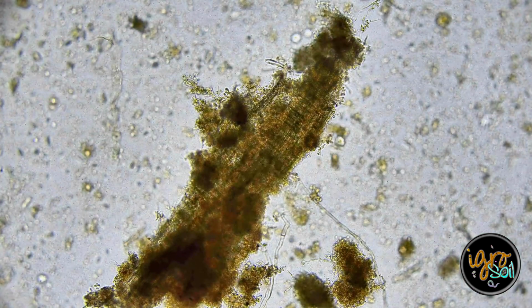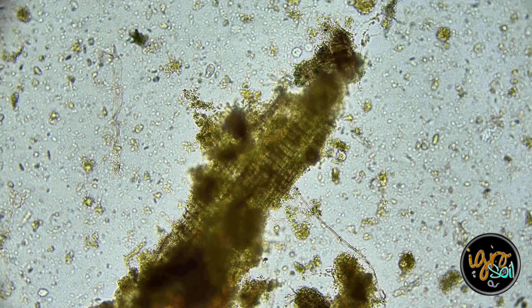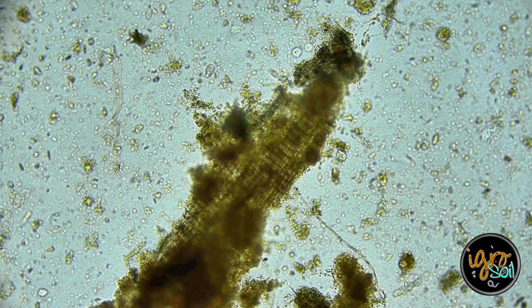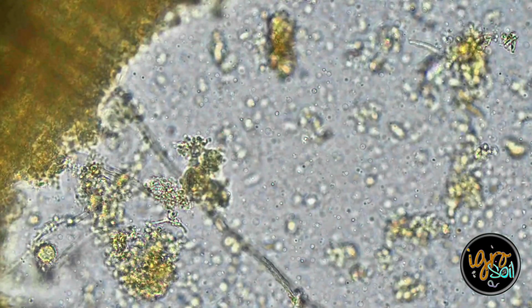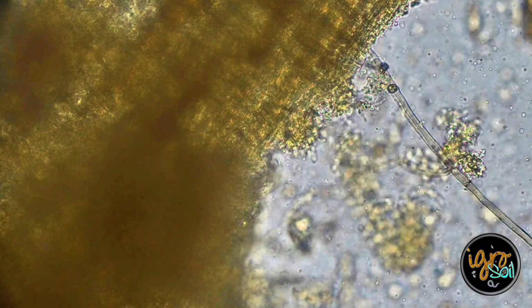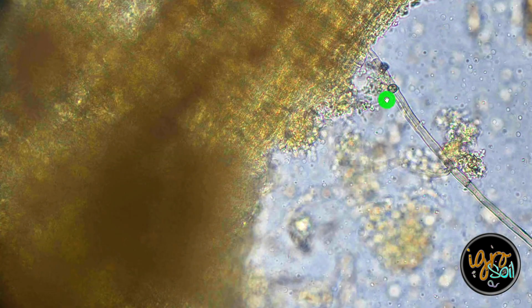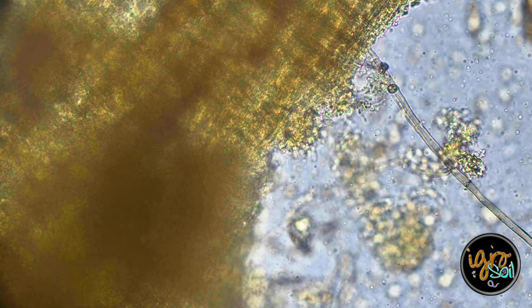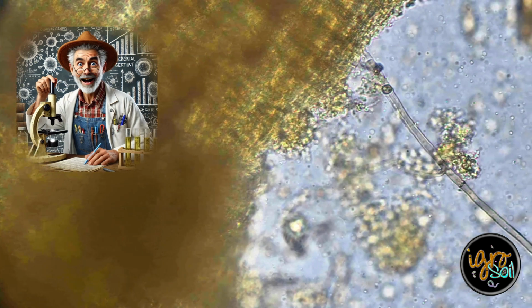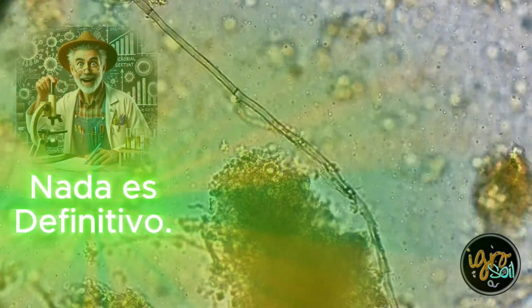Now here we're looking again at hyphae. I'm going to go back. Let's look at it. Look at the difference. You see how consistent that is? That's even got a spore. It's even producing a spore, probably. And everything's going to be probably and maybe here, okay? Because nothing's definite. We're taught that. You take a microscopy course, they teach you that nothing's definite because it's not.